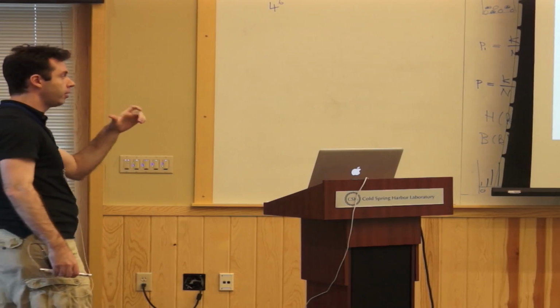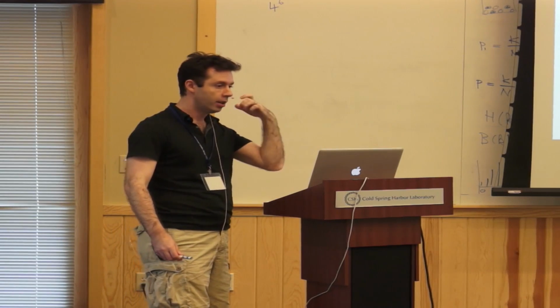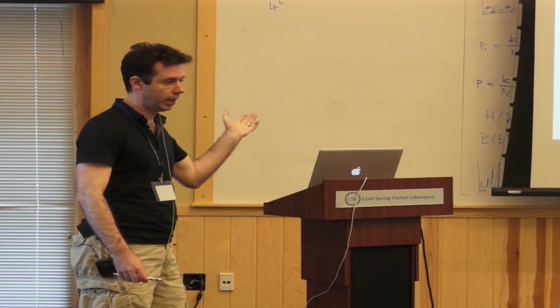The point of this, I want you to understand, is that the definition of a background is very important, and it really should be part of a specific question that you're asking about your peaks, at least in terms of motif analysis, okay?